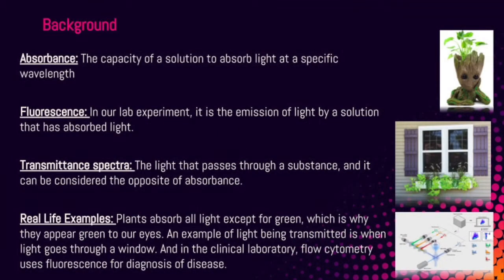Before moving on, there are some terms we need to define. First, absorbance is the capacity of a solution to absorb light at a specific wavelength. A real-life example of this would be plants appearing to be green due to the fact that the chlorophyll absorbs all light except green, leaving the rest to be reflected.